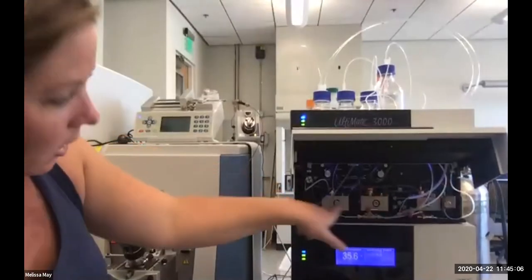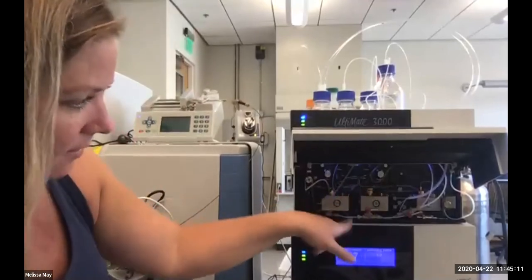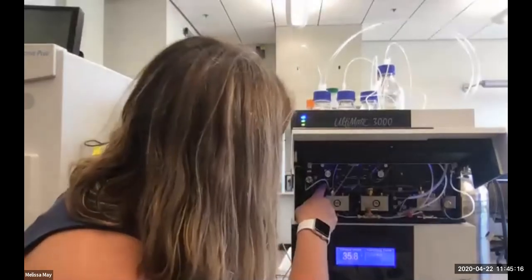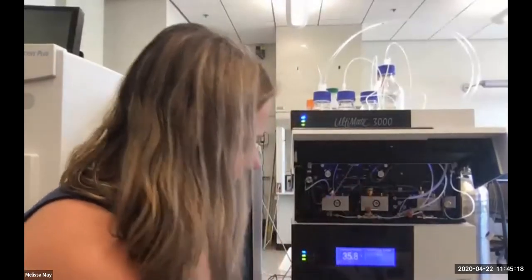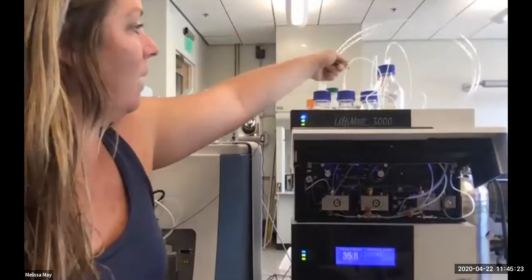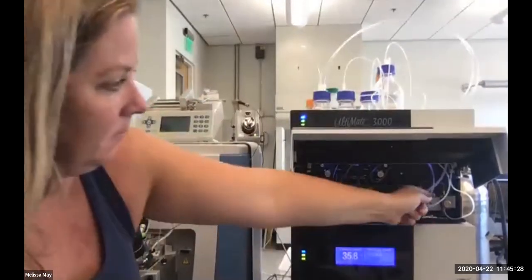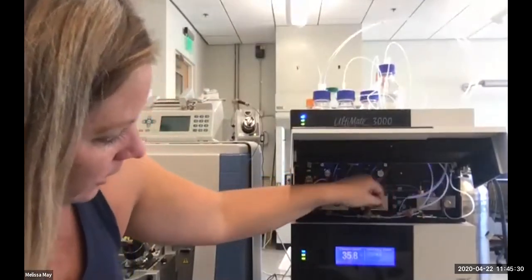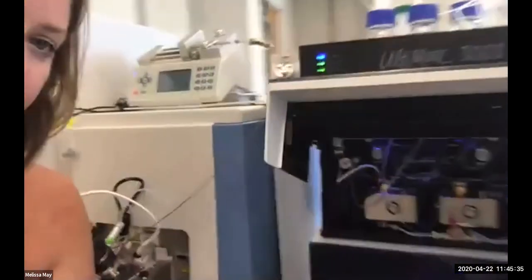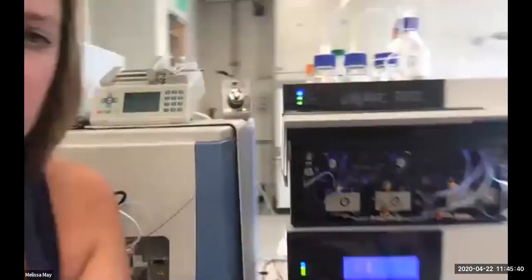These two are solvent A and solvent B. And you can follow, again, the plumbing through this, but up here, again, I know you can't see this, it actually says A and B and where these inlets are coming from and which block they're connected to. So again, looking up at the top, this is my solvent A. This is going to come down here, hook up through this connector. So if I wanted to shut off flow of this pump block, I could turn this valve. I don't want to do that though.